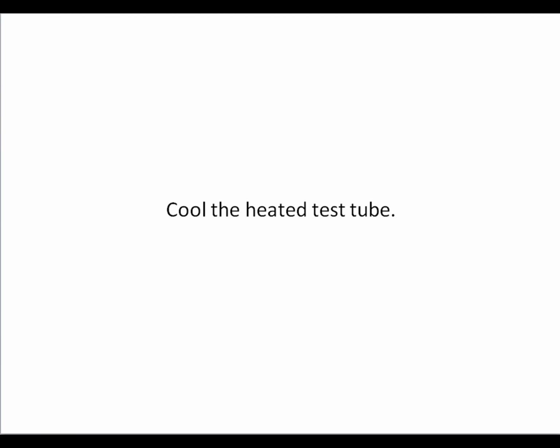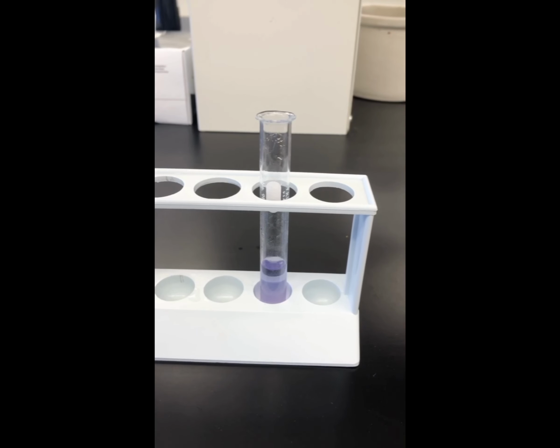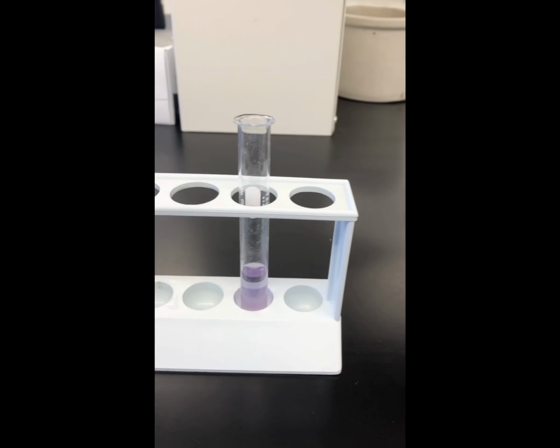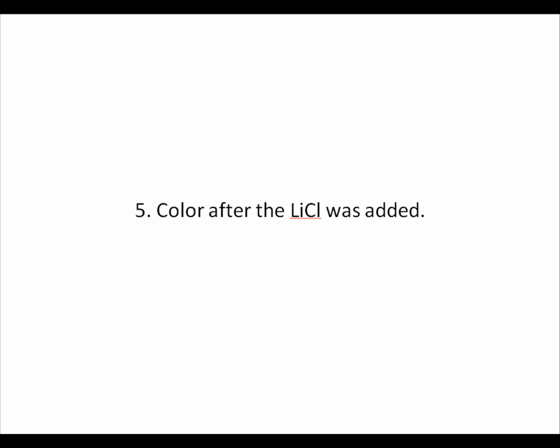Now you're going to cool the heated test tube. Number 4, color after cooled. Number 5, color after LiCl, or lithium chloride, was added.